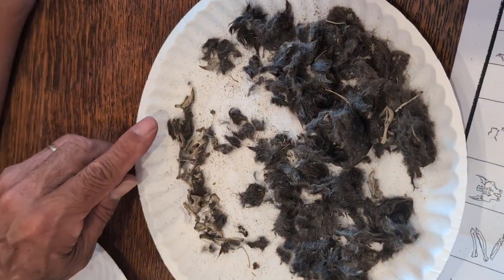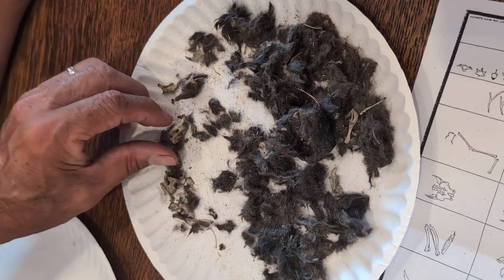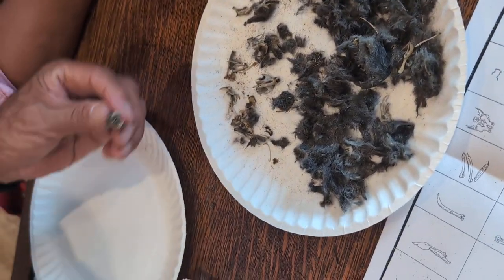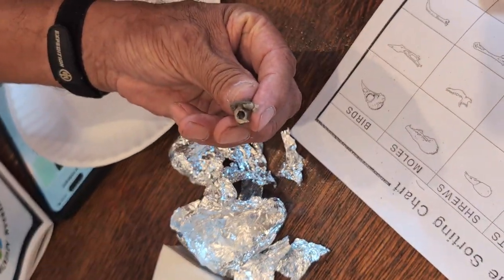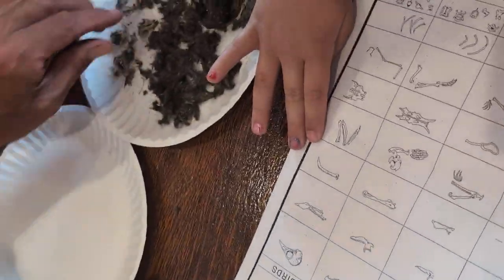So over here — one, two, holy smokes, three mice! That's the skull of one mouse right there, that's the skull of another mouse, and that's a skull of another mouse. Oh, what's this in here? That's just the backbone — that's called the foramen magnum, that's the opening where all of the nerves from the nervous system come out.